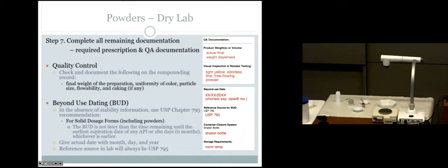Humidity, moisture, absolutely. Which is why storing this powder in a refrigerator would be bad. It wouldn't be bad because it got cold, but what about the air quality in a refrigerator? It's very moist. It would be a terrible idea to do that. So again, that's why we specified definitely room temperature on it. Okay? Any questions on that?